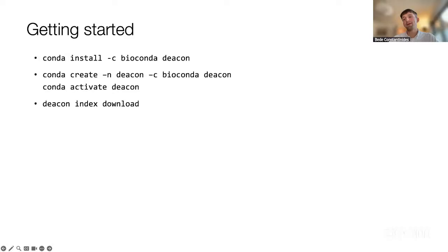I'd say there's only one other tool that has a similar philosophy and achieves high accuracy in complex metagenomes, and that is this tool called Cleanifier, which I mentioned.